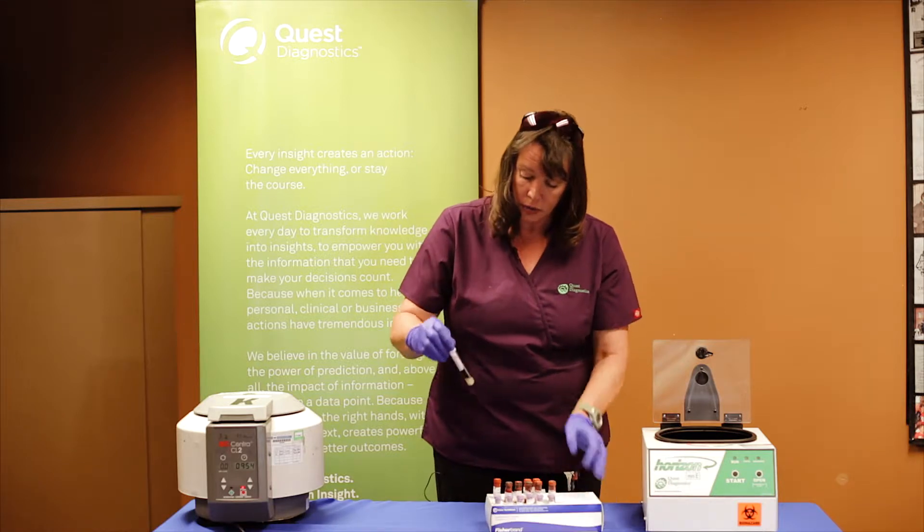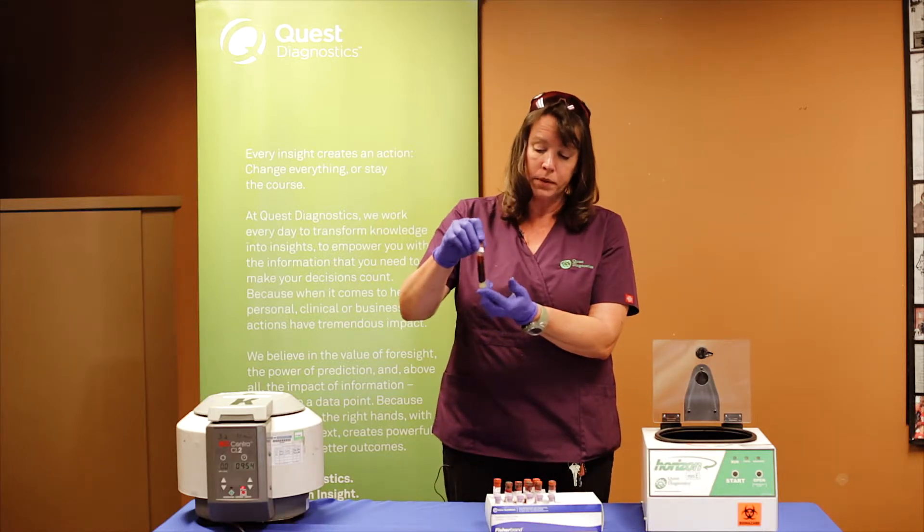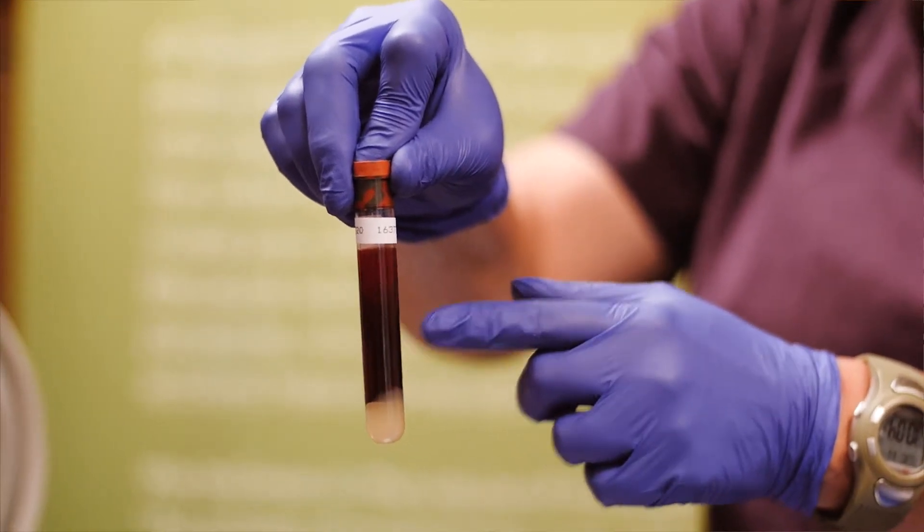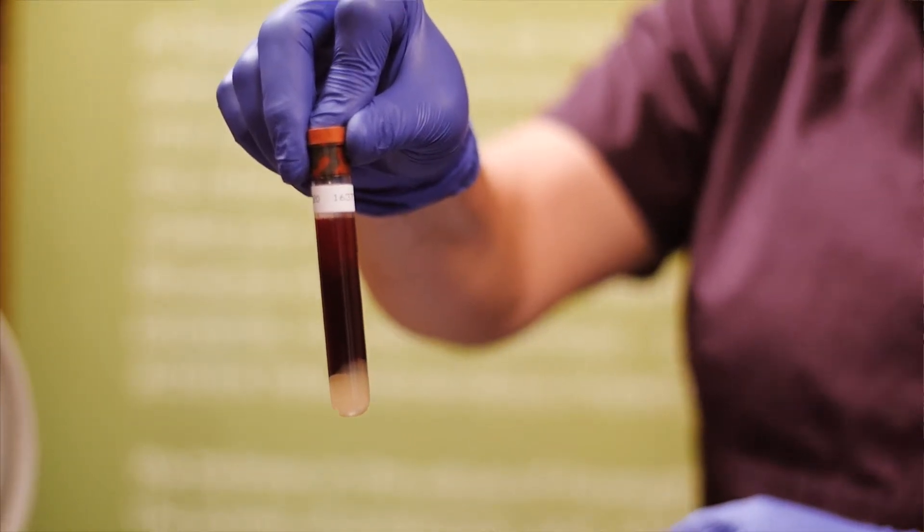This is what's called an unspent sample. That means that our gel is in the bottom and you have all this red stuff up at the top — that is your whole blood at this moment in time.